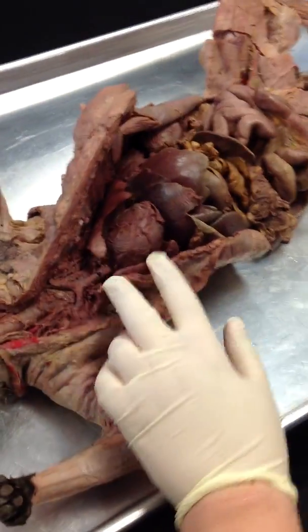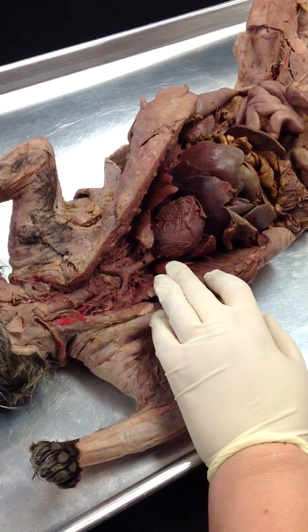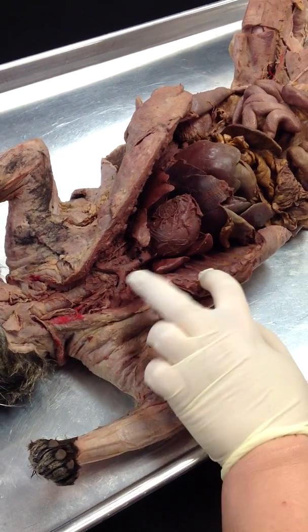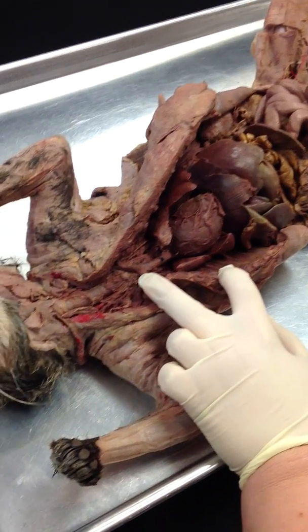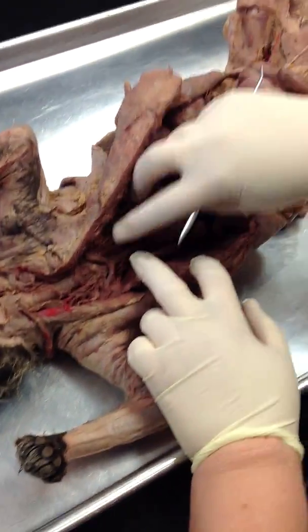They fall apart. Let's put that back down. Okay, so what do you have? We don't know where the aorta is. Did we do veins on the top or no? Do we feel good about the veins on the top? We hadn't even started veins. We were doing arteries. Arteries, okay.